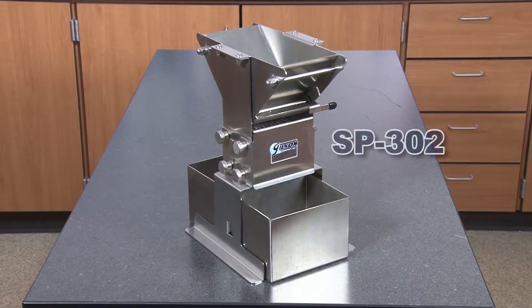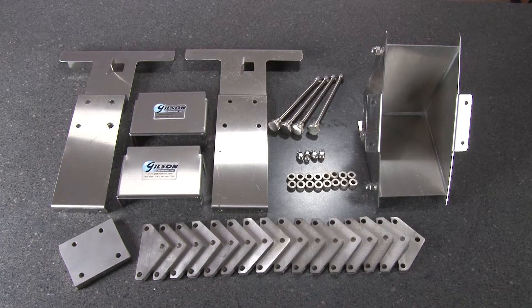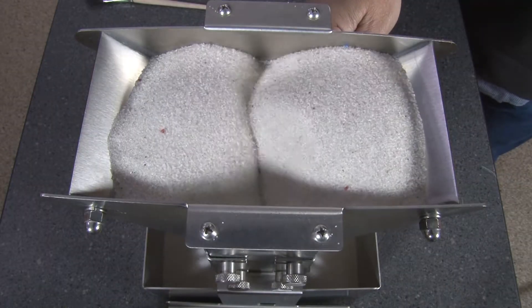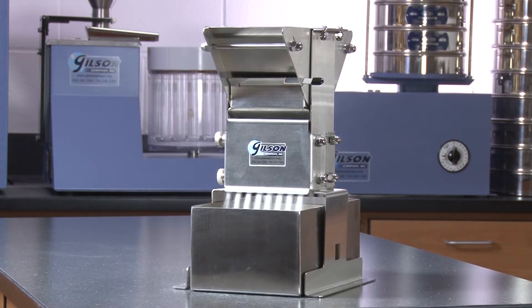Gilson offers several micro and precision splitters. These riffle-type splitters have fixed-width chutes and are constructed of stainless steel with gate-release hoppers, and are designed to divide small samples of fine powders.